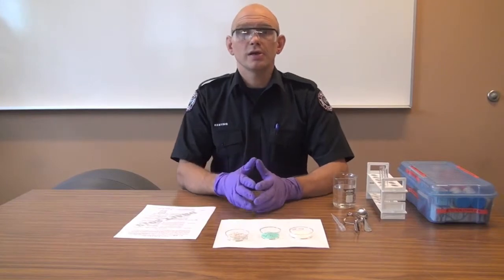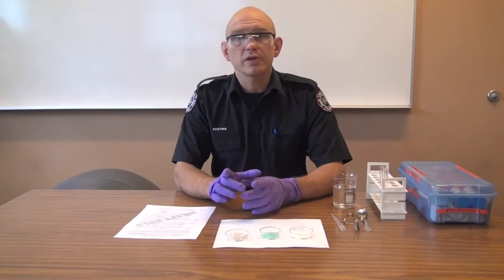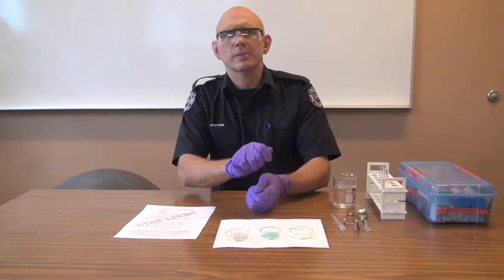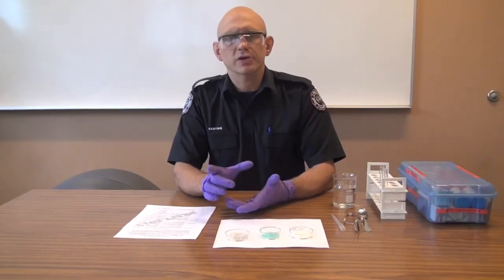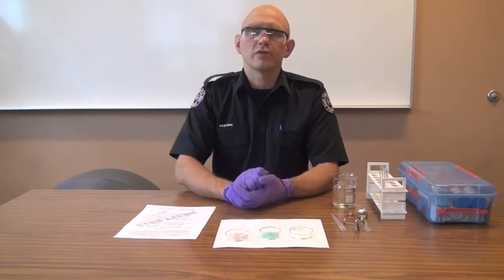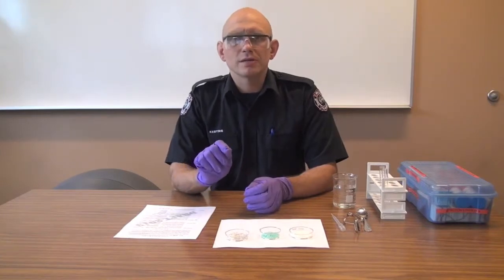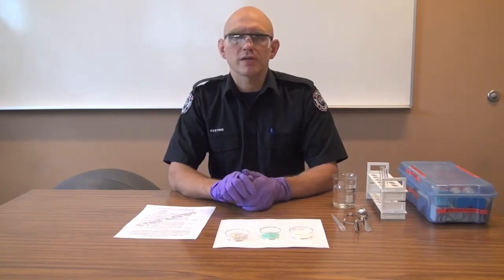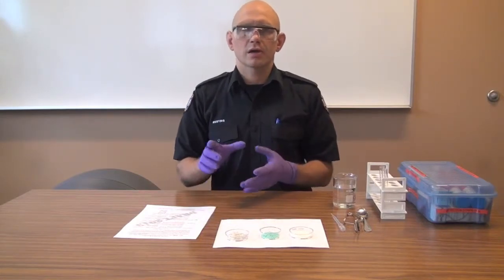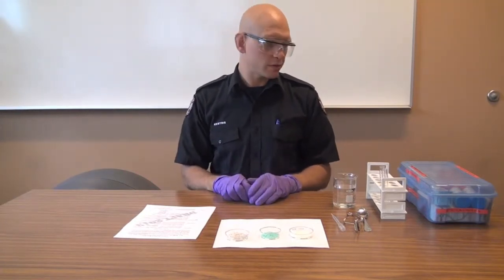Another safety note: be very, very careful when collecting your physical sample, especially if you're dealing with any kind of crystals. If you had a jar with crystals around the edge, you don't want to be scraping those off — that could be a friction-sensitive explosive. It will go off if you try to scrape it or unscrew the lid. So you want to disturb the physical sample as little as possible. If it looks like stained old glass jars with crystals around the edges of lids, basically don't touch it — call the bomb squad instead.